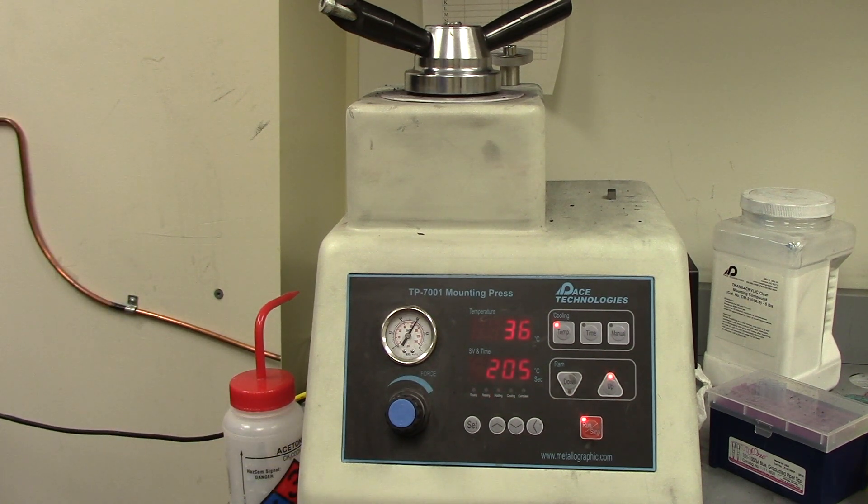Once that finishes, I'll be able to bring it over to the Tegramin 20 polisher and set it to grind and polish the surface to make it nice and smooth. However, let's say that you don't want to permanently mount your sample or that you want to be able to reuse it again. Let's move on to a different method to help quell your qualms.